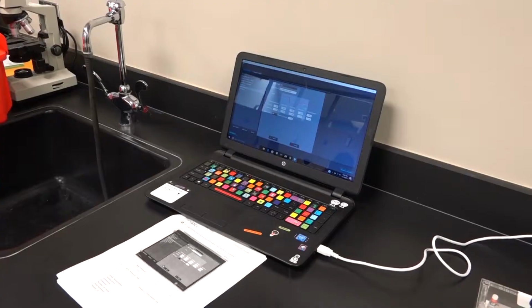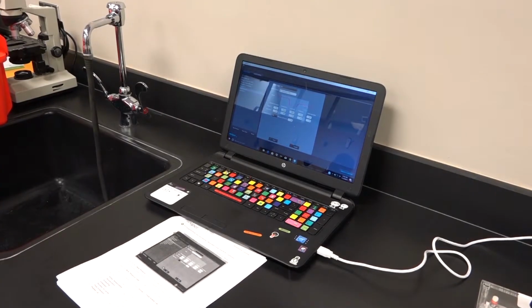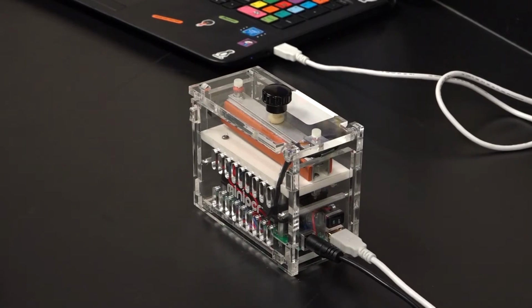Basically, what happens in the PCR machine is that the PCR machine controls the temperature levels. And in that process, as you're changing the temperatures, it's allowing your DNA strands to separate. It allows primers, forward and reverse primers, to come in and bind, and then you use your polymerase to build additional DNA strands. And I said tries to explain because I drifted off and started to think about donuts.